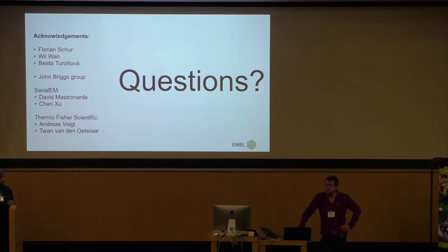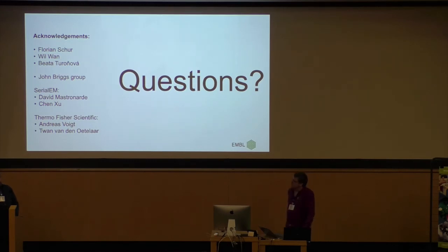May I start then? Do you think there is any sense to focus in 2 areas instead of 1? Have you seen how non-flat this thing was when you tilt it? These 2 areas assume that you have a flat grid or that you have a ramp, which still means it's flat. So it means we just double the error. It just costs time, it's not needed. You need to have small beams and focus as close as you can to the area that you're acquiring, I think.